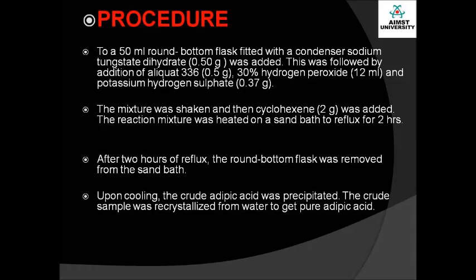After 2 hours of reflux, the round bottom flask was removed from the sand bath. Upon cooling, the crude adipic acid precipitated. The crude sample was recrystallized from water to get pure adipic acid. Once we get the adipic acid, check for its melting point and also percentage yield.